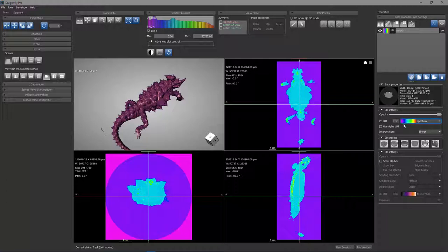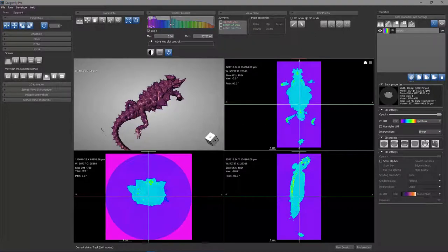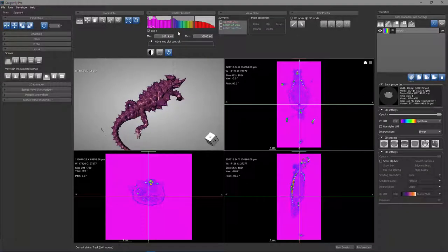In this case, it's the spectrum color map that goes from a purple through blue, green, yellow, orange, and red. And you can see how those intensities are mapped on my window level. If I adjust my window level, you can see that everything below the minimum is this purple or magenta, and everything above the maximum is red.